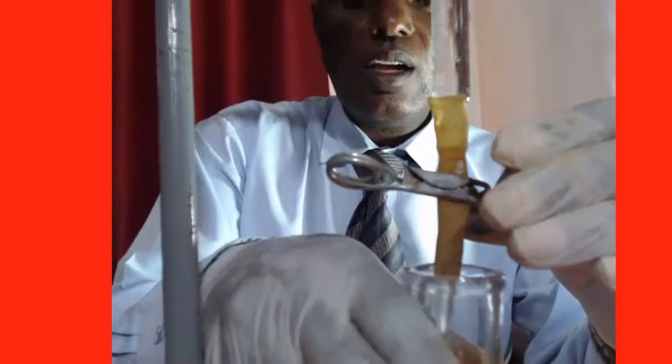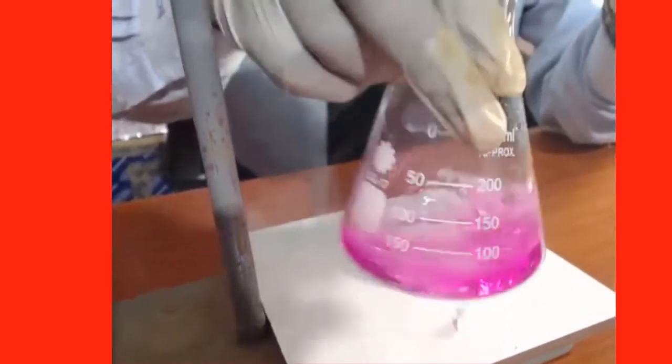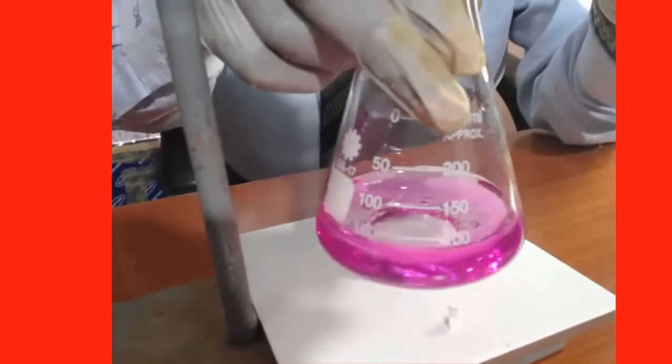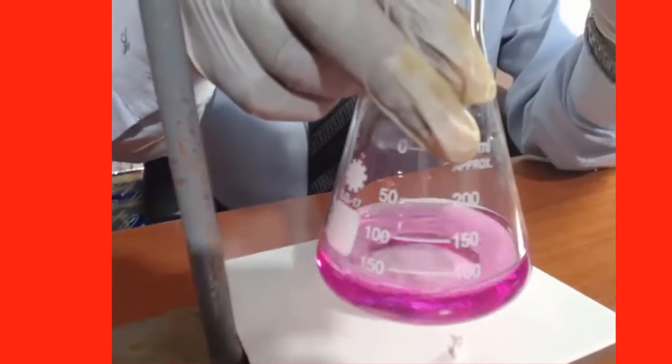Continue adding slowly, don't add a lot. And as you observe, my solution is almost turning. It is supposed to turn colorless at the end point.